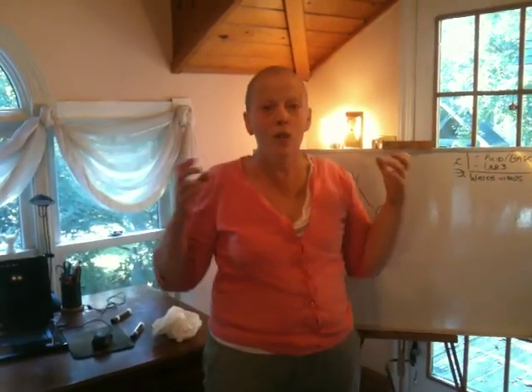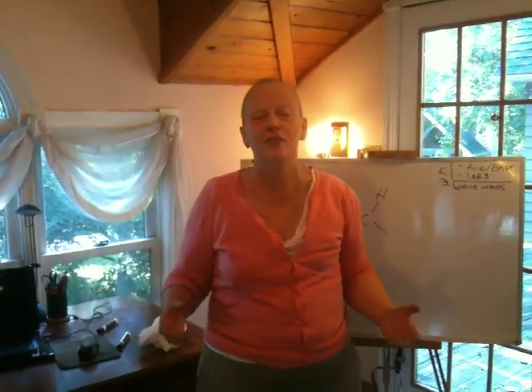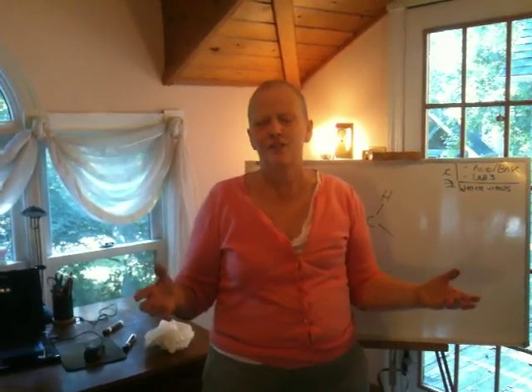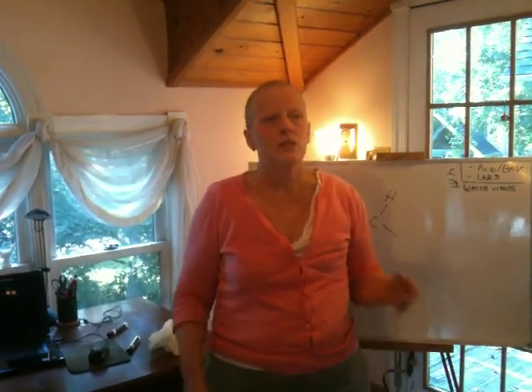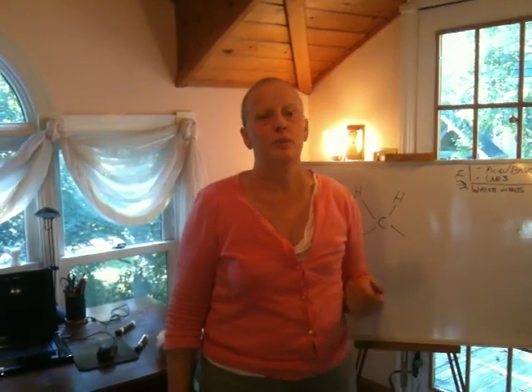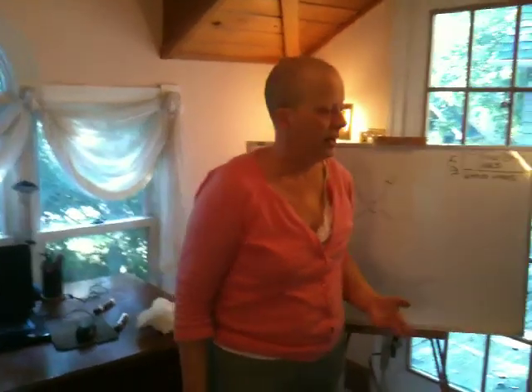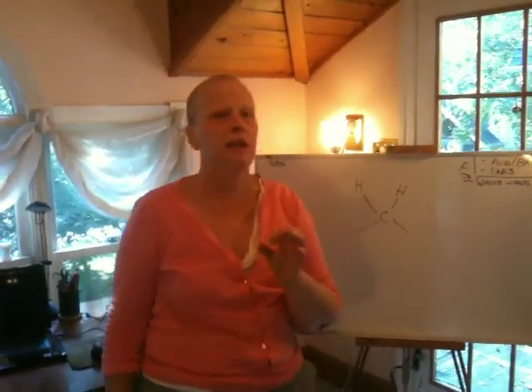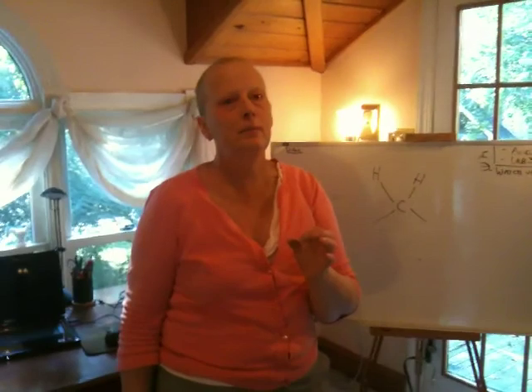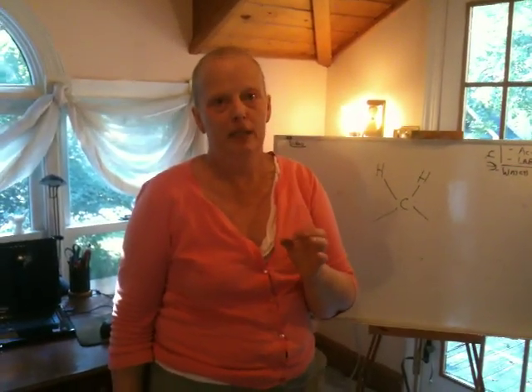There are 4 different ways a CH2 group vibrates, and they all have different frequencies, right? You think, that sounds fantastic. It's not so fantastic. It's too much information. So you're going to see we pretty much just focus on stretching vibrations, particularly during this first semester. Okay? All right, so I'm telling you that so you start to understand a little bit as to why the spectrum is really complicated. All right?